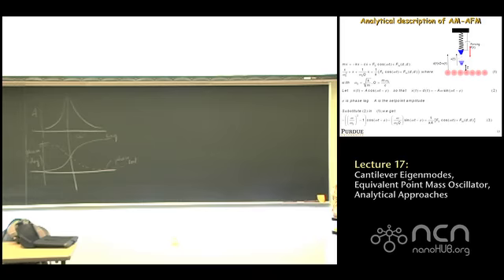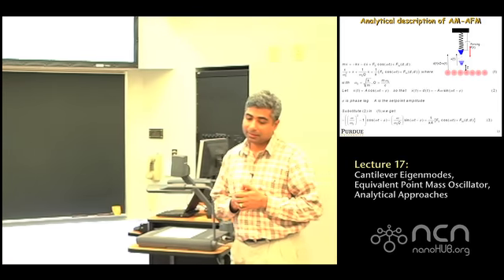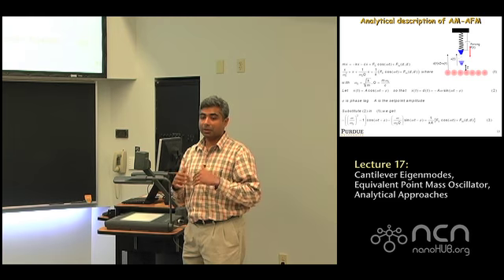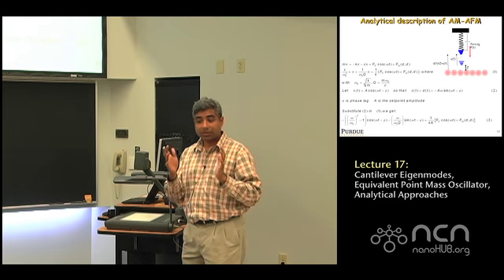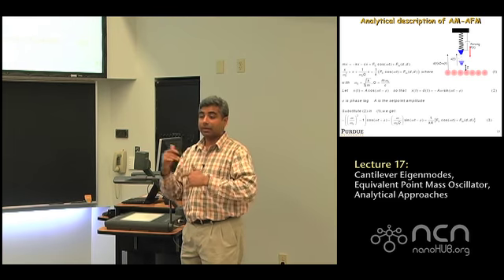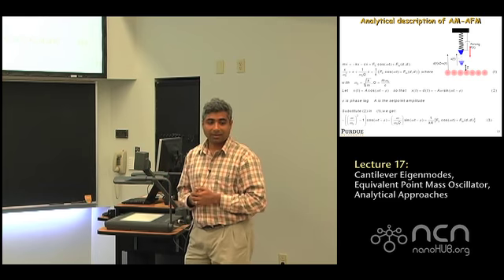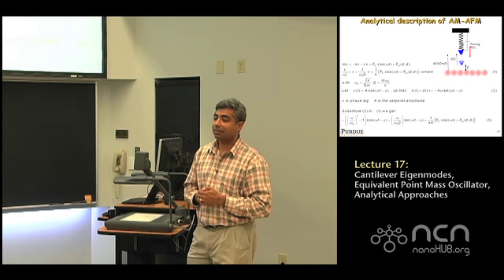So in other words, we use the fact that we know theoretically, when you're withdrawn from a surface, you do a tuning curve. I've shown you the transfer functions. You know how it should behave. And so see what you get, and based on that, judge if it's lead or lag.